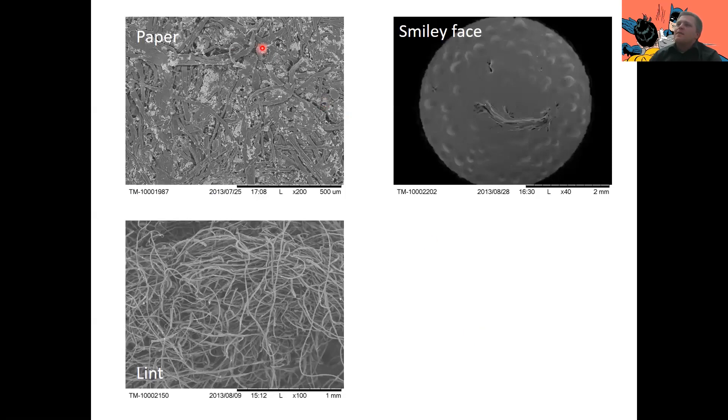Then here's three more pictures. Here's just a piece of white printer paper that I threw on there. This is at 200 times magnification. And here's a piece of lint that I pulled out of my pocket. I think the lint actually looks pretty cool. Just like a bunch of strings everywhere. This is at 100 times magnification. I feel like maybe I should have more pictures of balances or glassware at the end of this. Not microscope slides. But, eh, whatever. Whatcha gonna do? And here is the picture. There's a picture of a smiley face I tried to draw in some carbon tape. So carbon tape is just this black tape that you use to tape down like paper and lint and so forth to your sample slide or your sample stand before you put it in there. And I'm not super proud of this. Can't even see the one eye on it. Anyways, that is our second lecture. If you have any questions, feel free to reach out and let me know.